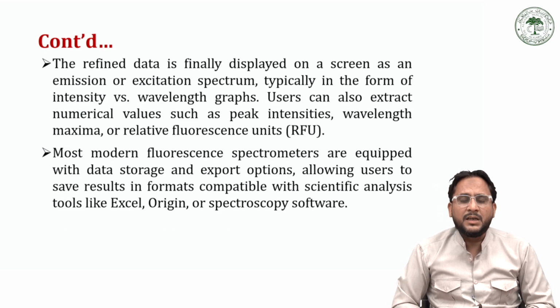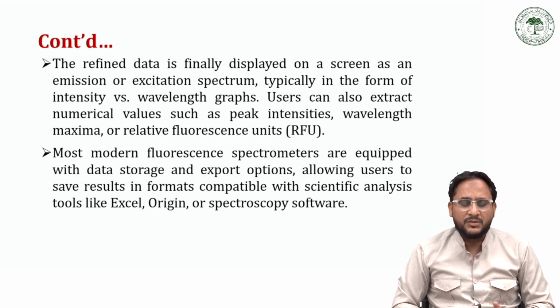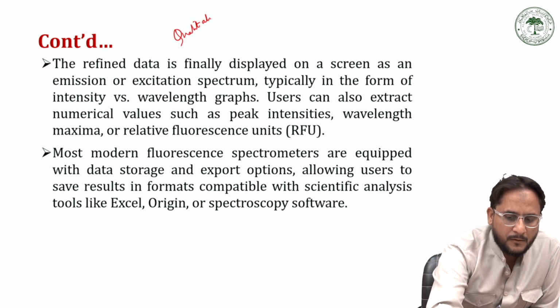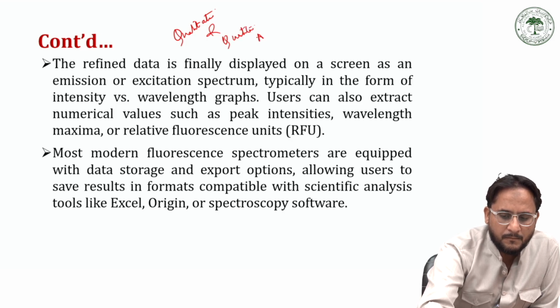The final refined data is presented on a computer screen and can be used for the study of the sample, which ultimately helps us to identify the type of sample, its nature, its structure, as well as its concentration. So the data thus obtained can be used for qualitative as well as quantitative analysis, for both.